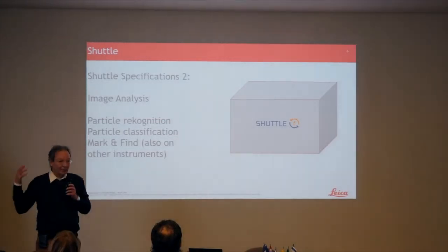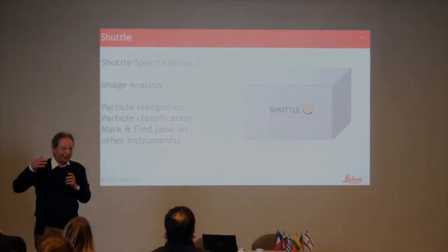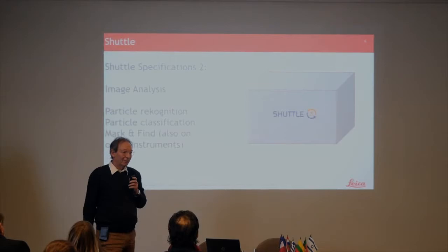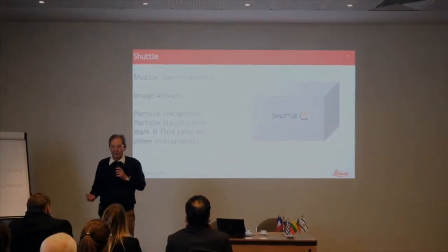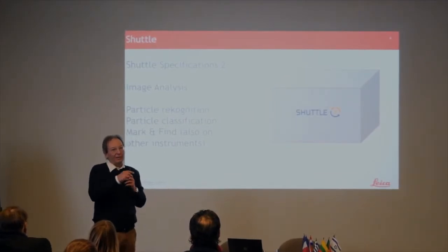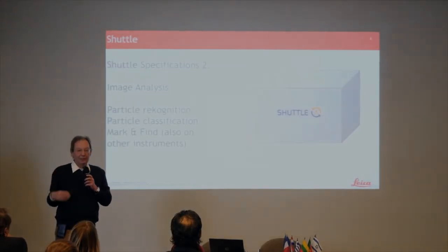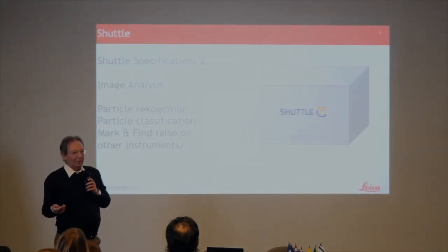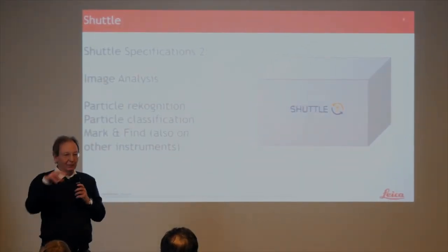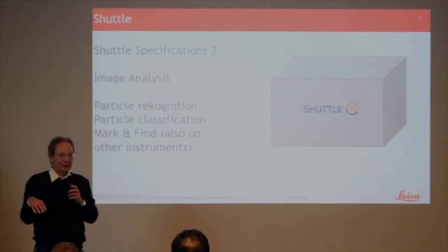Then, image analysis, we are relatively good in that. Leica Microsystems, respectively Cambridge Instruments, which is now part of Leica Microsystems, invented image analysis. So that particle detection and saying, okay, this is a fiber, this is a spot, it has this and this color, this is all doable. But again, doing that on a large scale, instead of just the particles that are of interest, has also some huge implications.